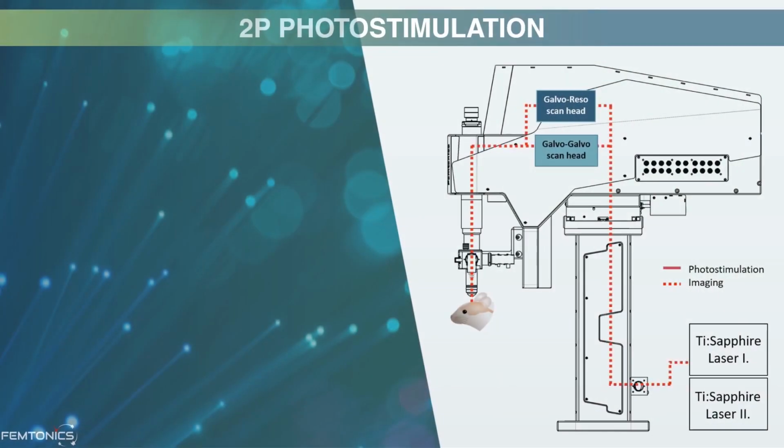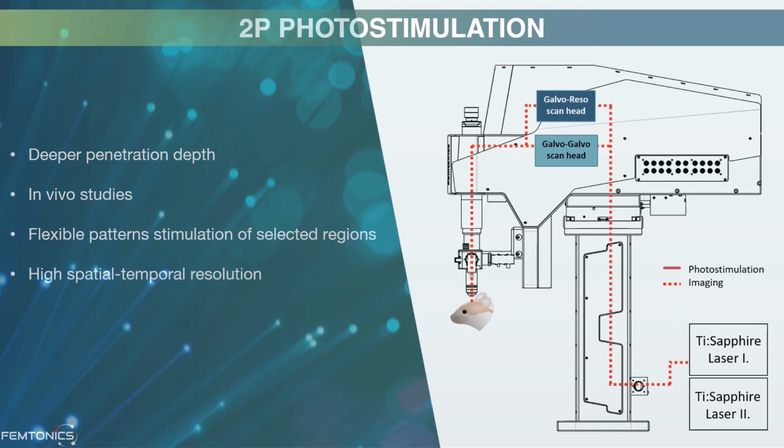We've discussed the hardware requirements and applications of two-photon stimulation extensively earlier in this webinar. It provides advantage over one-photon stimulation by enabling deeper penetration and provides advantage over LED photostimulation by having better spatiotemporal resolution. For these reasons, two-photon stimulation is usually used in vivo settings.